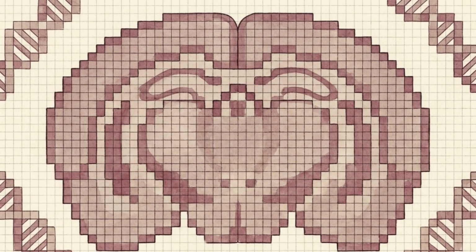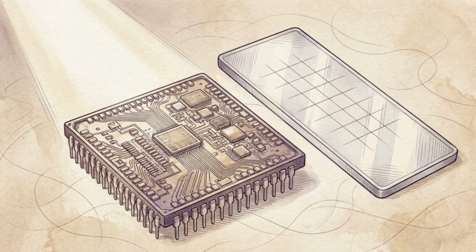These microarrays excel at generating broad molecular atlases across entire tissue sections, but they average out the data at the multicellular level. BGI's StereoSeq platform was engineered specifically to close that 55 micrometer resolution gap. Instead of printed microarrays, StereoSeq utilizes patterned arrays constructed from DNA nanoballs, generated through a process called rolling circle amplification.